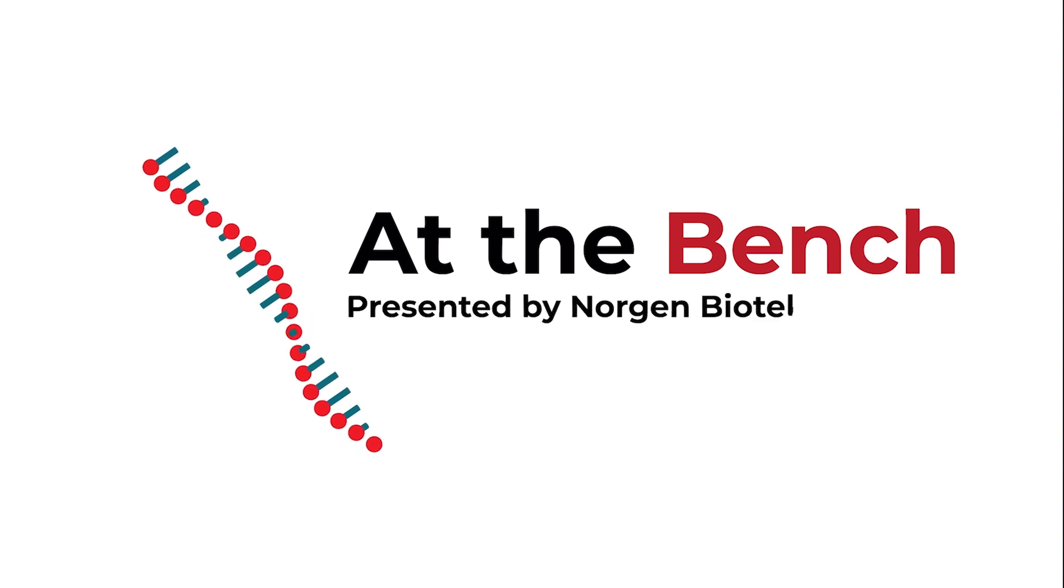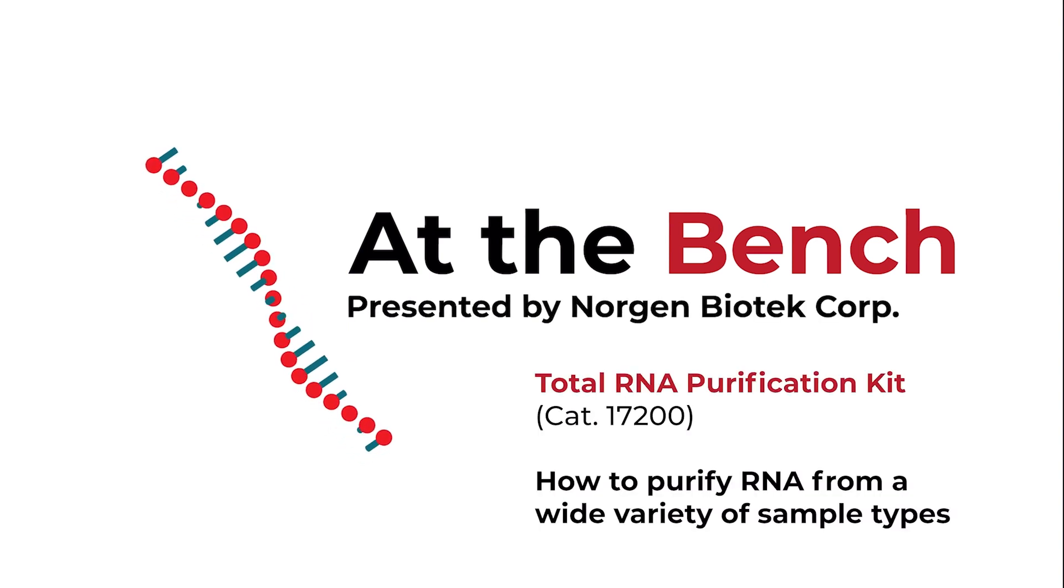Today, we will be demonstrating the step-by-step workflow for the Total RNA Purification Kit, Catalogue number 17200.